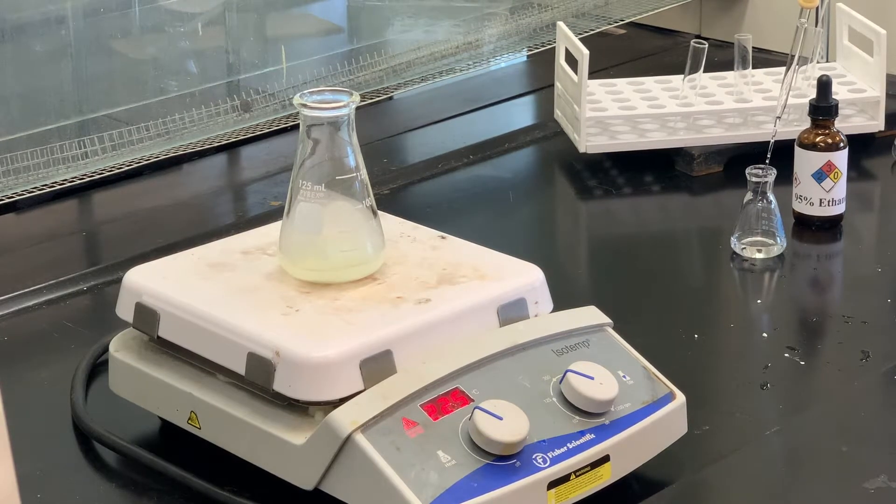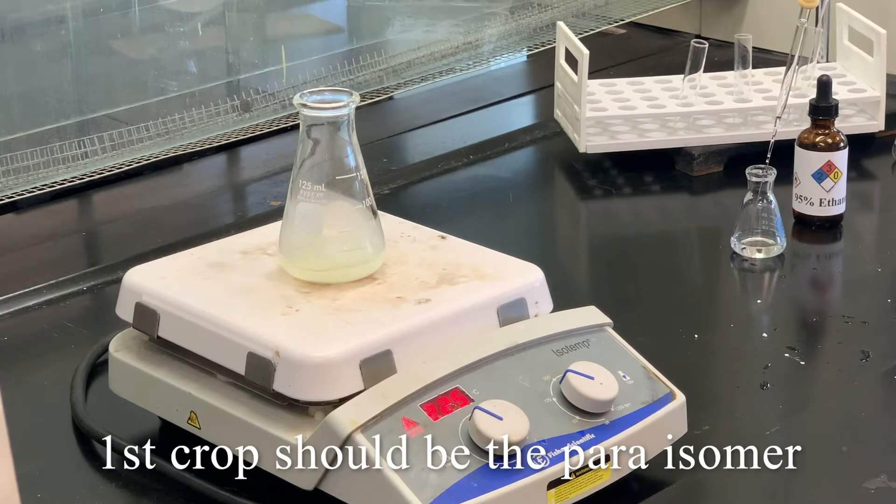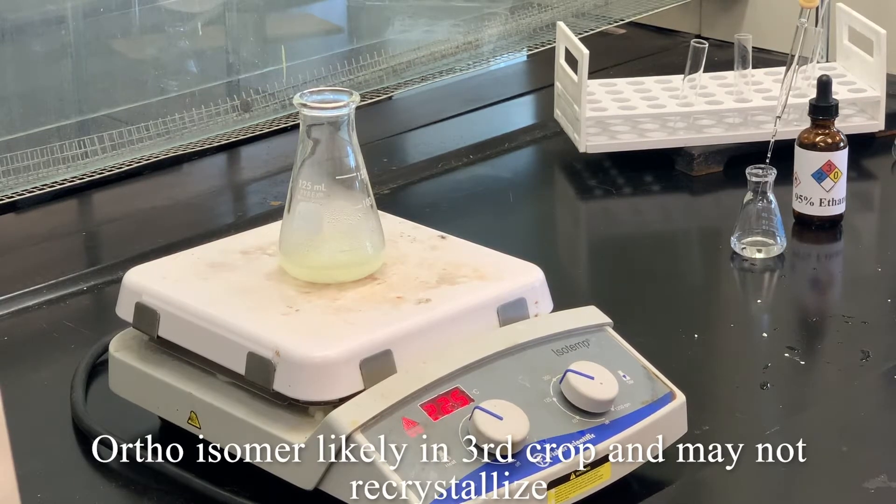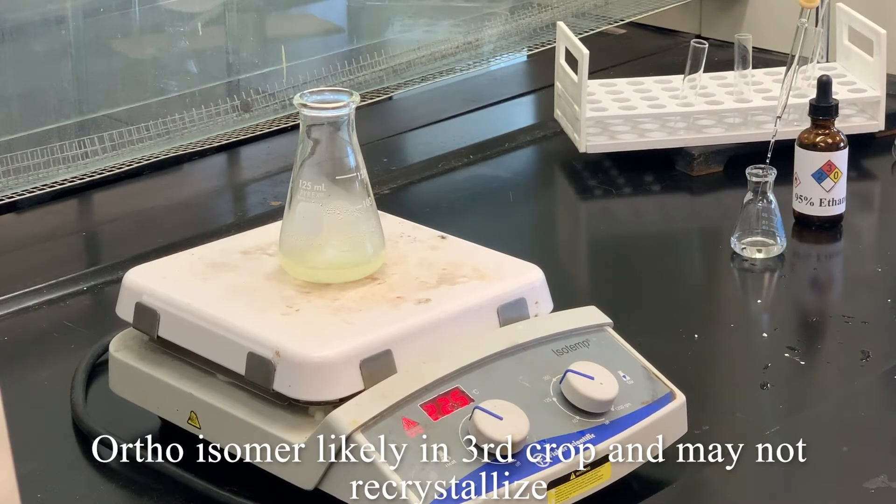We're hoping that the first crop — and we're going to try to collect three crops in terms of different products — will be mostly the para isomer. Once we collect the first crop, we'll take the filtrate, boil that down, and collect the second crop, which will most likely also be more para isomer. The ortho isomer is extremely soluble in ethanol and usually has a lower melting point than the para isomer. We'll boil down the filtrate from the second crop and see if we get a precipitate — but we may just have to take that liquid, which should contain mainly our ortho isomer.